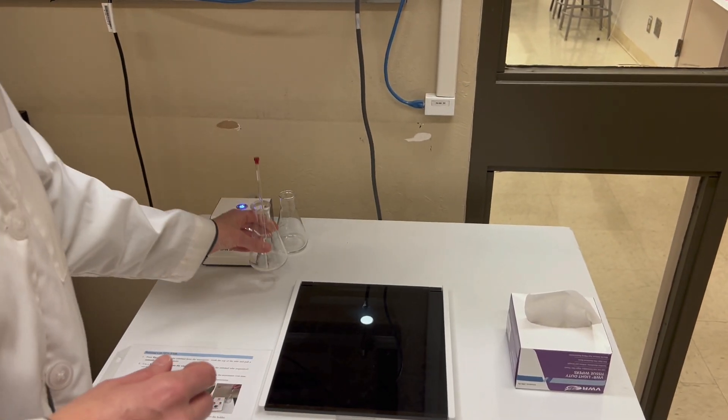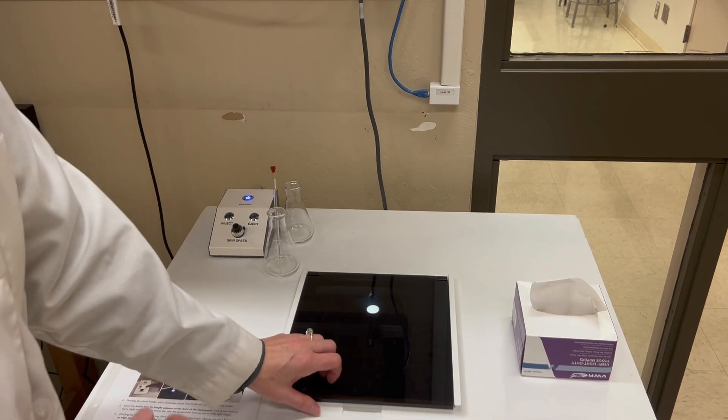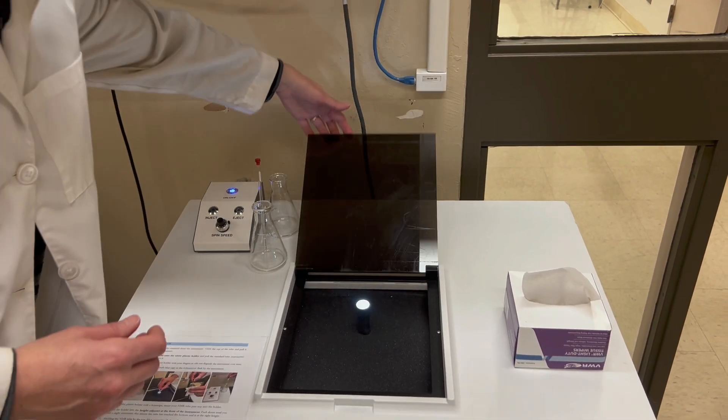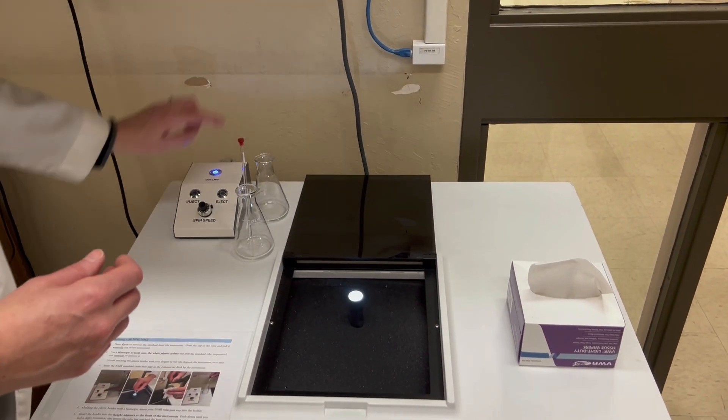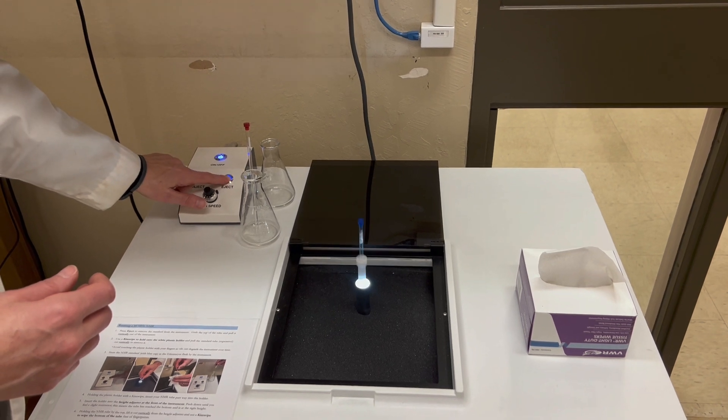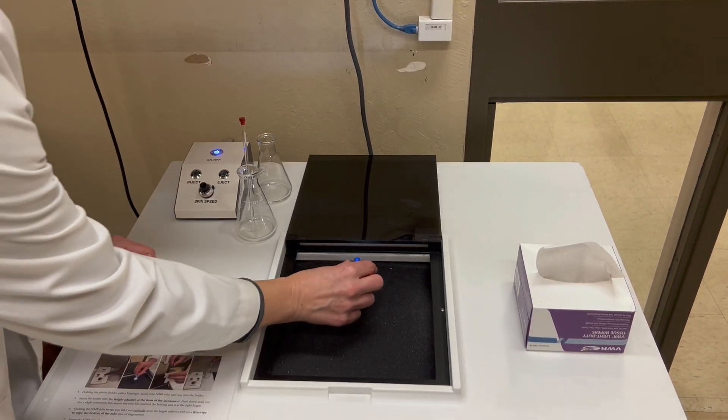Then at the NMR you can set your sample down and open up the flap. You can push the eject button and that will shoot air up through the machine and push out the old sample.